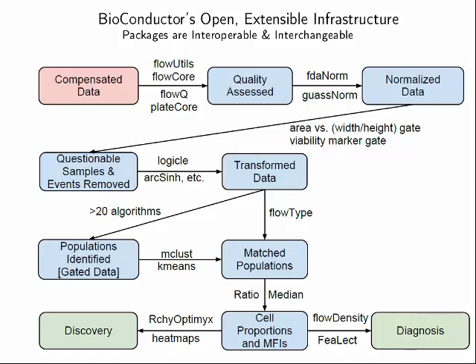Are you talking about the old method of adjusting compensation again? Yes, exactly. So I don't know if anybody does that. We see data sometimes that is like that, old data. Hopefully nobody's doing that anymore. Yes. I think most of the machines now.